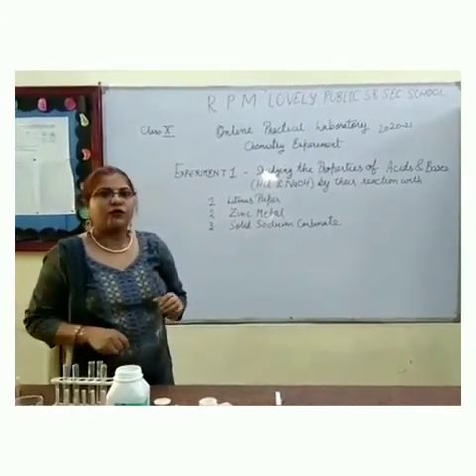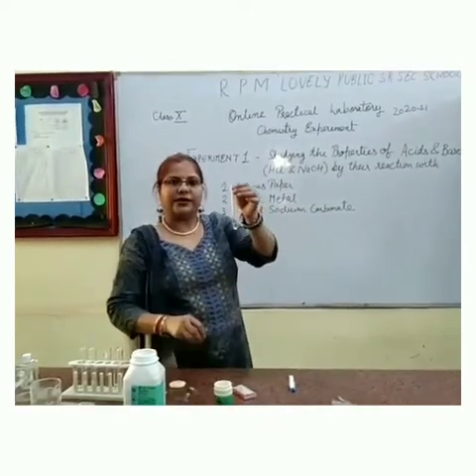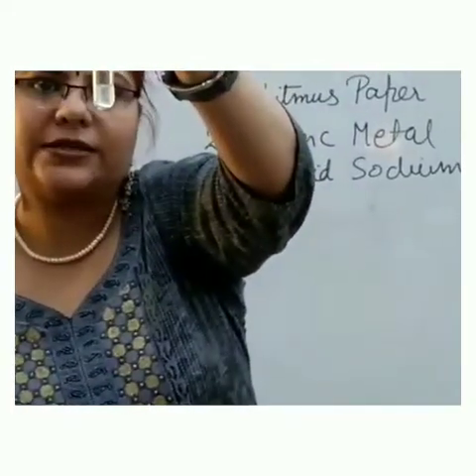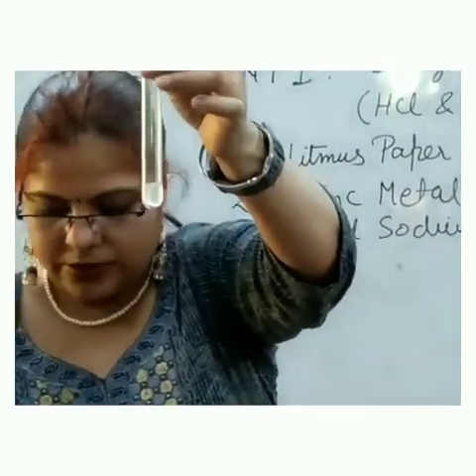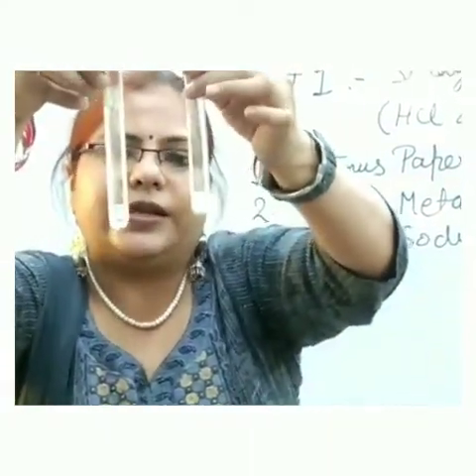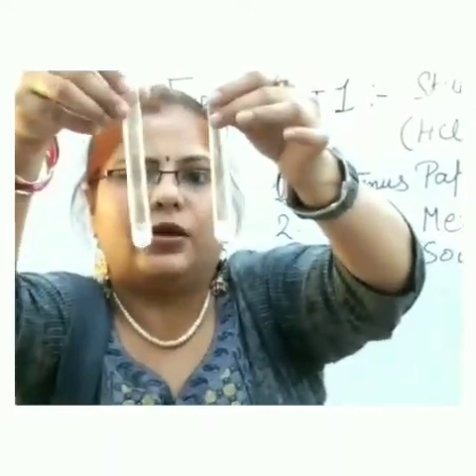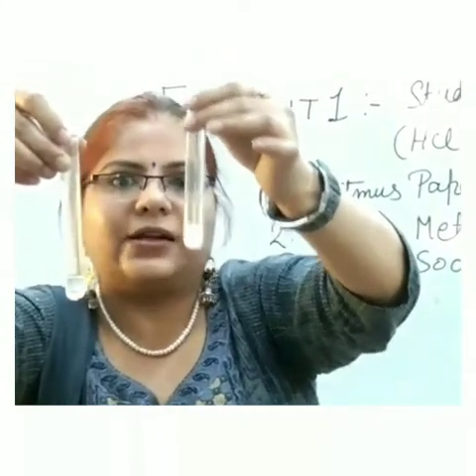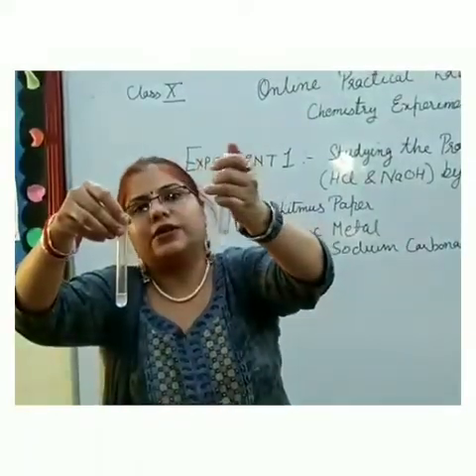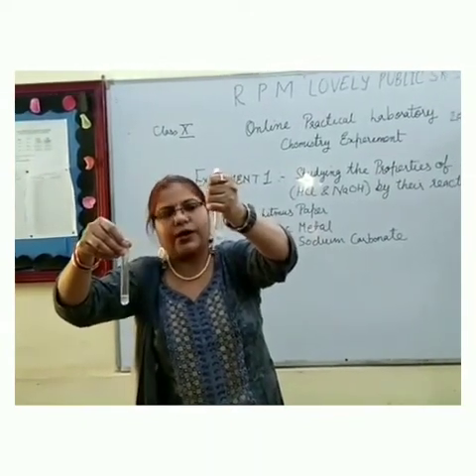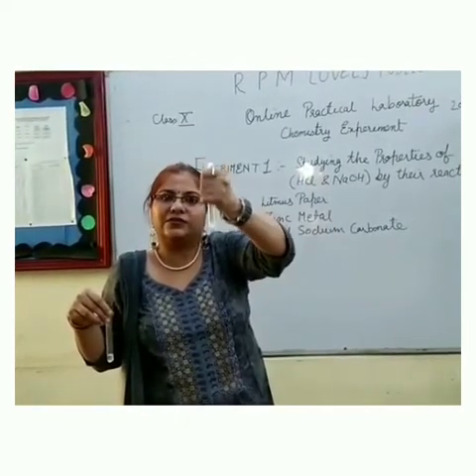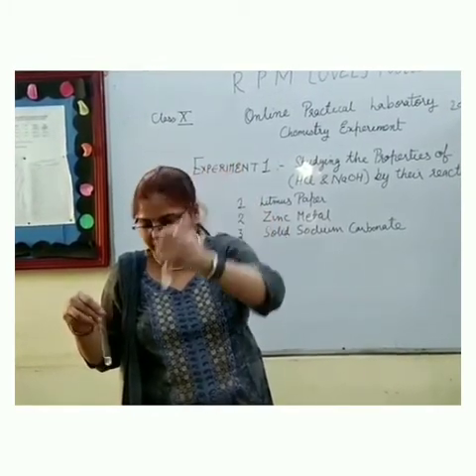Now we will see the effect of zinc metal in acid and base. We have taken acid and we will add zinc metal in this. You can see that small bubbles of hydrogen gas are coming very vigorously. But if we add zinc metal in the base, there is no such gas produced. So we can see that acids react with metals to liberate hydrogen gas. We can test this hydrogen gas — if we bring a burning matchstick near the mouth of the test tube, it will burn with a pop sound. This confirms that the gas is hydrogen gas.